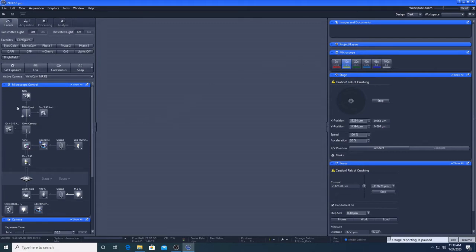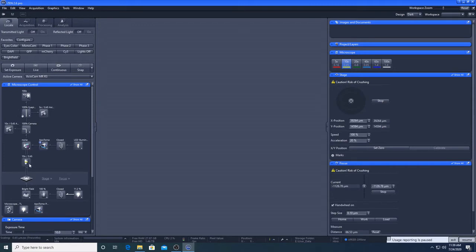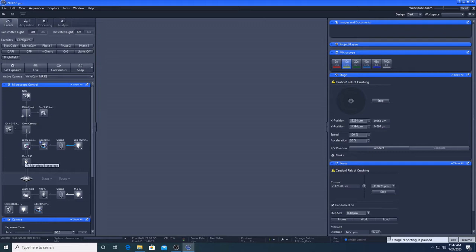This diagram illustrates the light path within the microscope. It can act as a helpful reference for troubleshooting if what you are seeing through the Oculus or the camera is not what you would expect. Brightfield Imaging uses this white light as a transmitted source which passes through the shutter when it is open, then through the sample from below. It is magnified by the lens and then directed either to the colour camera here or the eyepieces here.